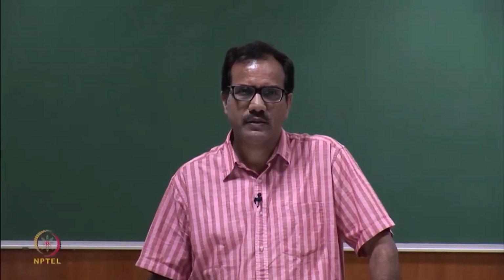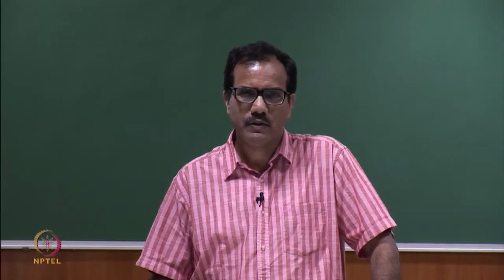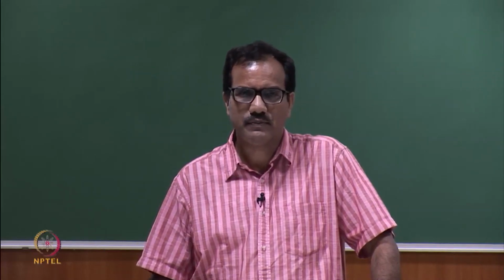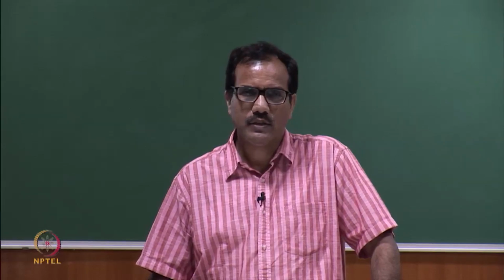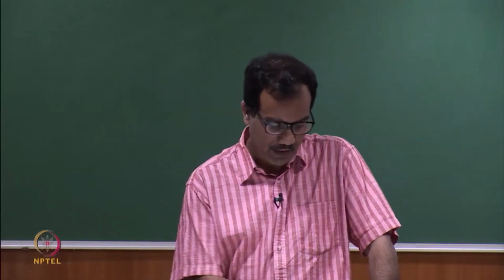Hello students. In the last few lectures, I have discussed fluorescence spectroscopy. In the last lecture, I was discussing steady state fluorescence. In this lecture, I will discuss time resolved fluorescence spectroscopy.